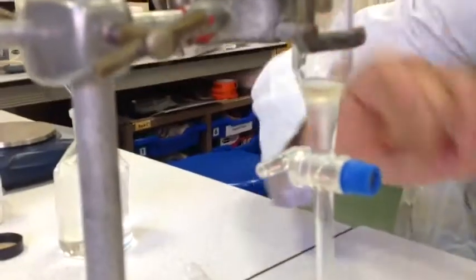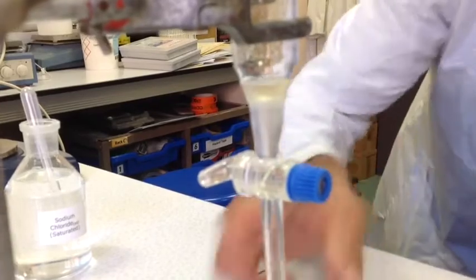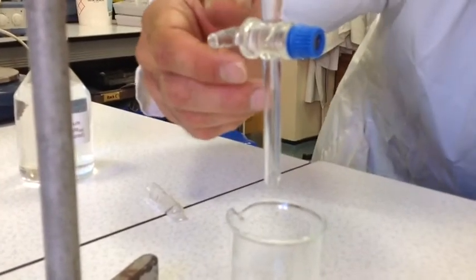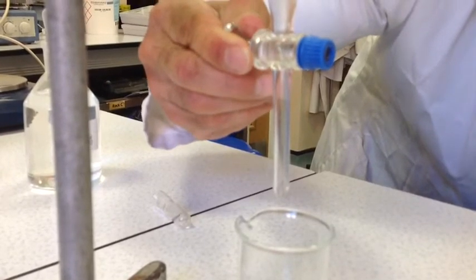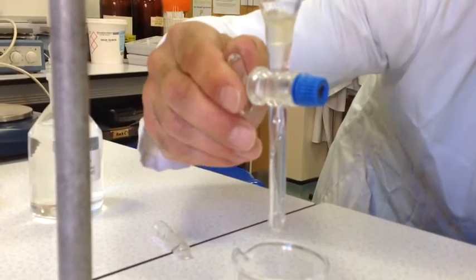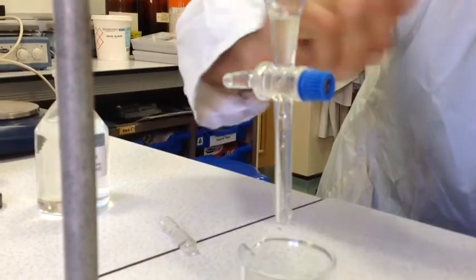Okay, once your sample has settled out and you can see two distinct layers, the aqueous phase at the bottom, your cyclohexene at the top, we will run off the lower layer into a beaker. So very slowly and carefully under your tap, watching the interface between the two, and we want to stop as the cyclohexene just reaches the tap.